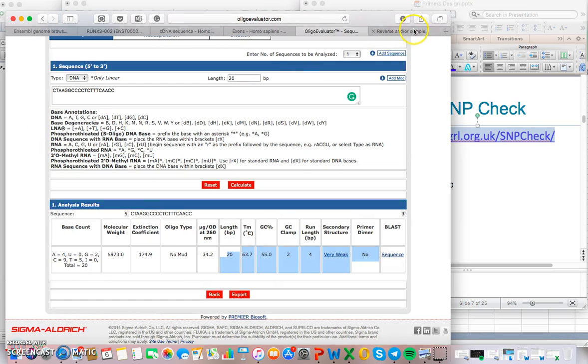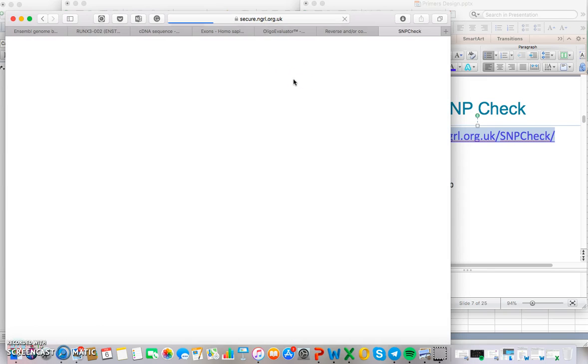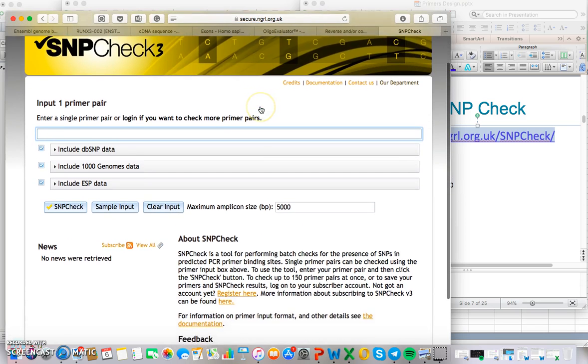Now, copy paste. This is kind of slowly. Come on. Ready. Excellent.